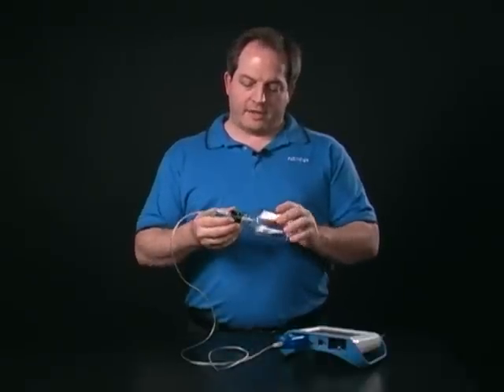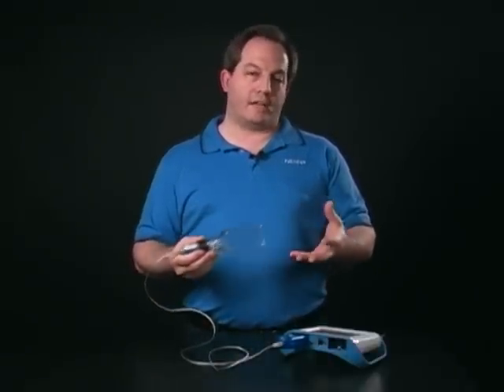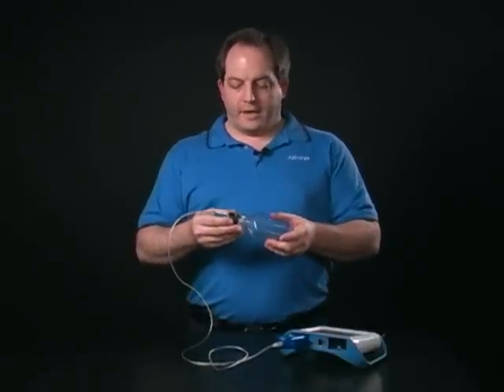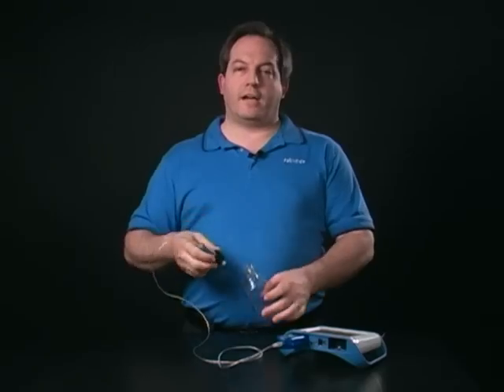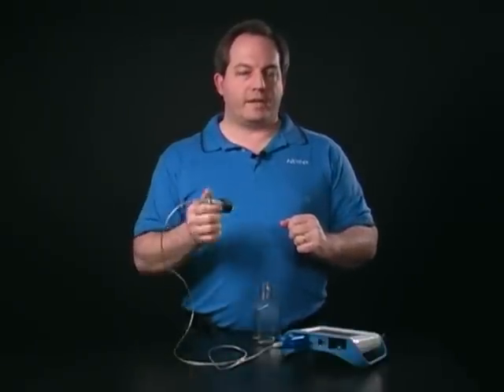It has a great range from zero to 100 percent of oxygen, and this lets you do a variety of biology experiments, including a catalase experiment, photosynthesis, or respiration. I could actually put samples directly into my sample box and look at the change in oxygen over time. I can take this outside, or put this into an enclosed environment and do things like the photosynthesis experiment. Again, great for biology.